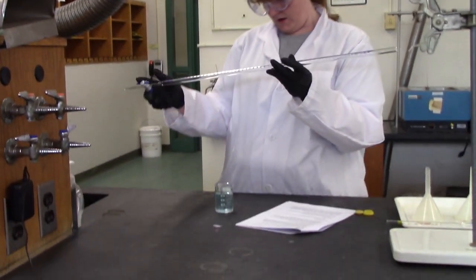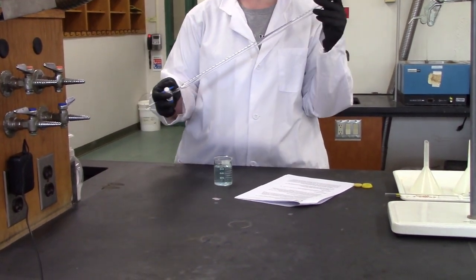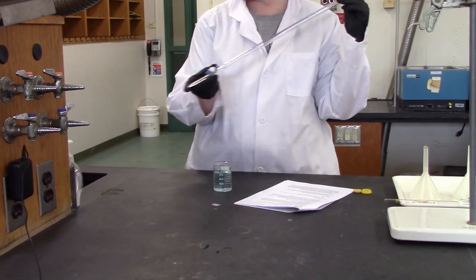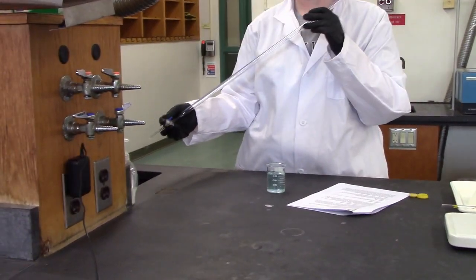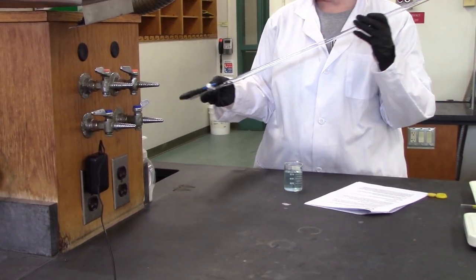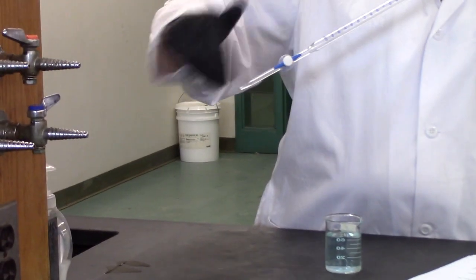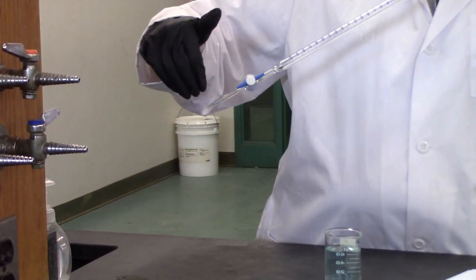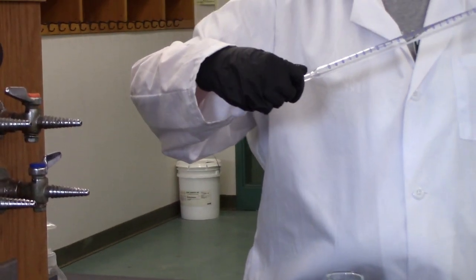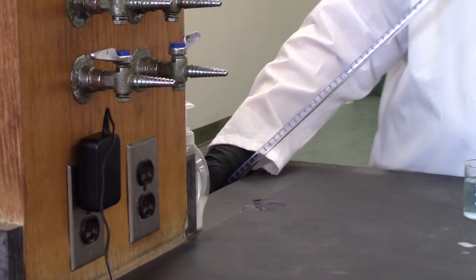So I filled up my 100 mil a little bit, and what I want to do is put the end in the sink, all right? We can put acids and bases in the sink because we have neutralizers. Normally we wouldn't do that, but our sinks are specially equipped, so it's okay. So we're going to put this in the sink with the valve open. You can tell it's open when it's pointing towards the direction of the glass. The cross is closed, and pointing in this parallel direction is open. So I'm going to put that end in the sink, okay?